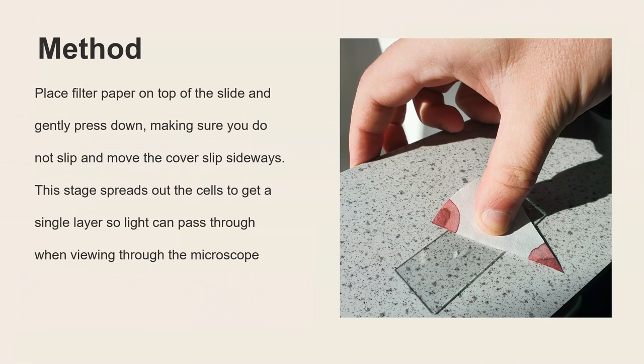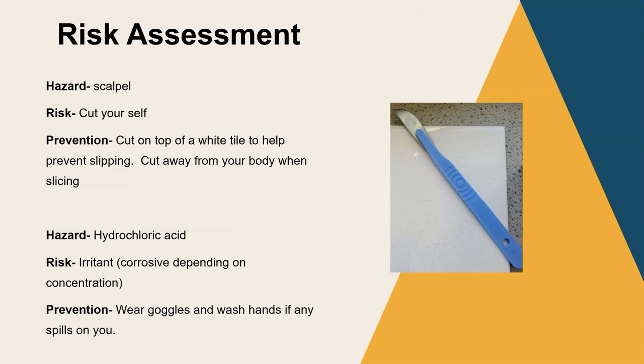Then the very last thing is we need to squash which is what the title of the experiment is root tip squash. So you place a bit of filter paper on top and you push down but you need to do this gently. If you do it too hard you're going to break the glass cover slip. You also need to make sure that you don't accidentally slip and move your cover slip to the side because that defeats the purpose of the squash step. This stage is to squash down gently so you get this really thin layer of cells so the light can then pass through them when you're viewing it under the microscope. If you slide the cover slip you'll end up putting a layer of cells on top of another layer and the light won't pass through and you won't be able to focus your image. You might also actually damage some of the cells and the chromosome so it ruins your image. So that's how we prepare our slide.